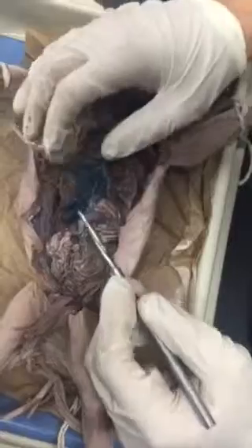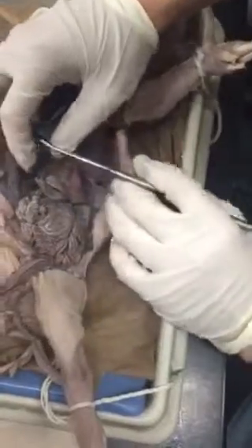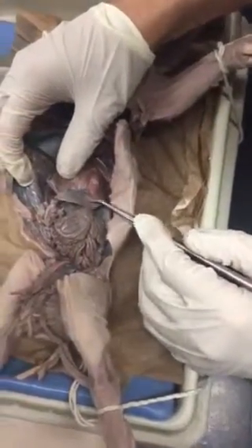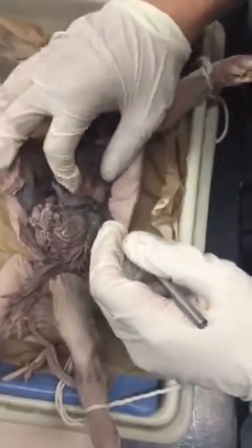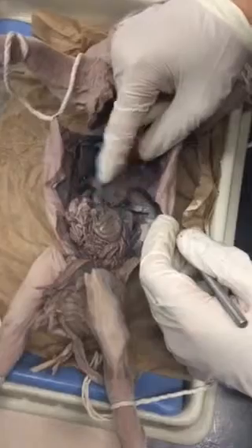Okay? And as we go on from there, we have these two pieces right here. This first piece is called your spleen. And as we move it back, we have this other piece right here, which is called your stomach.